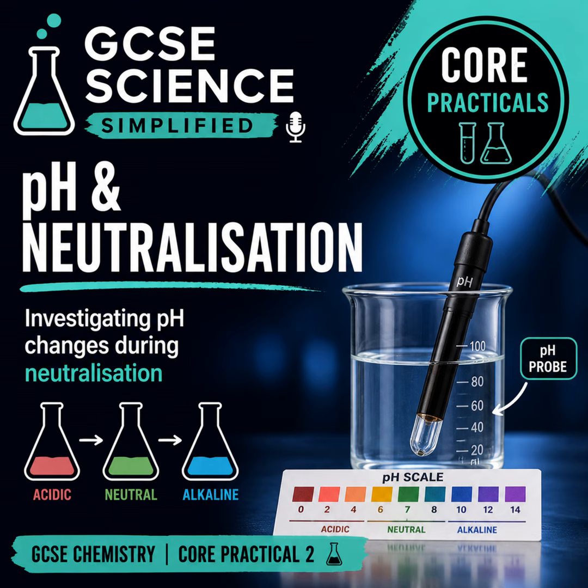Acids don't just sit there, they react, they change, and if you add the right substance, you can completely cancel them out. Today's question is simple. How do you turn an acid into something neutral? This is Chemistry Core Practical 2, and it's all about tracking how pH changes as we neutralise an acid step by step. Let's start with what pH actually means.